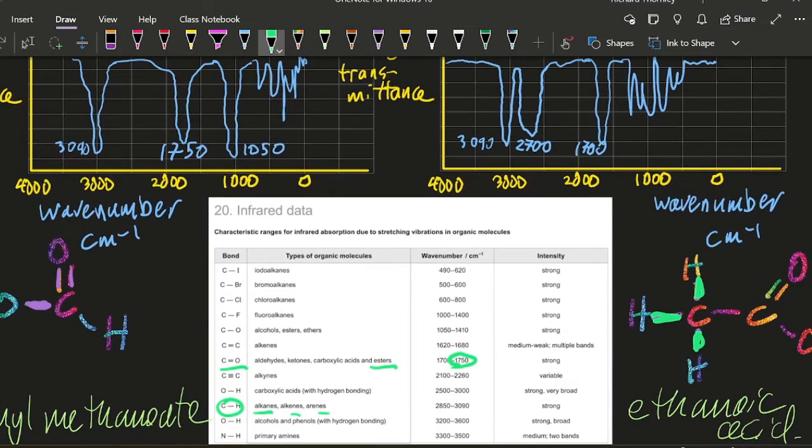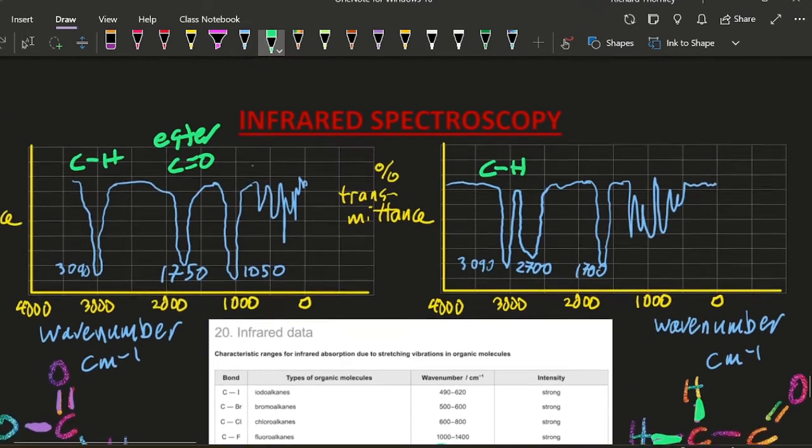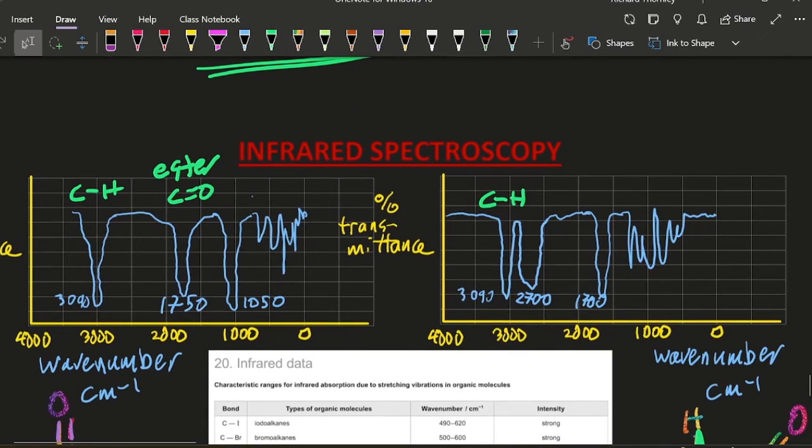That's CH. 1050. 1050. I see that. And again, it's an ester. And that's the carbon oxygen single bond.